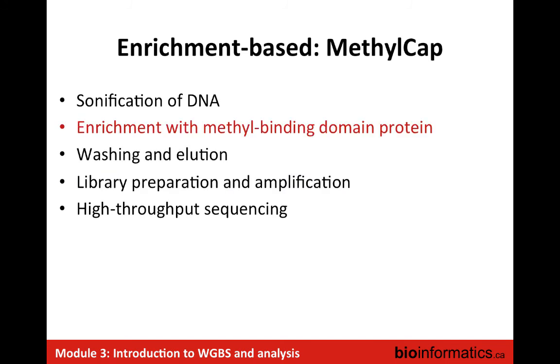Another method that's quite similar to that, conceptually at least, is MethylCap, which is another enrichment-based approach, where the enrichment this time is not an antibody, but a methyl-binding domain protein. So again, you're just enriching DNA that is methylated, and then it'll be very similar to a ChIP-seq analysis.